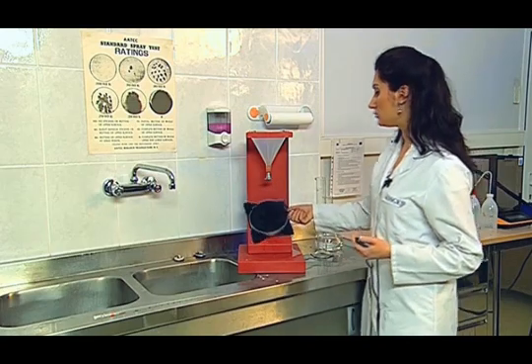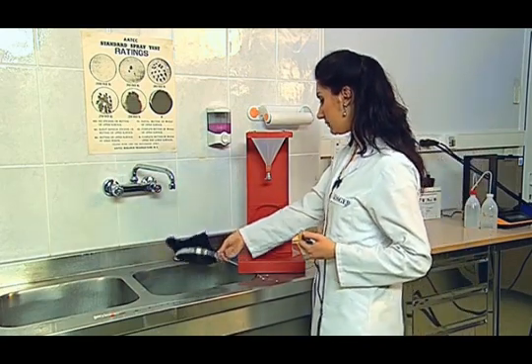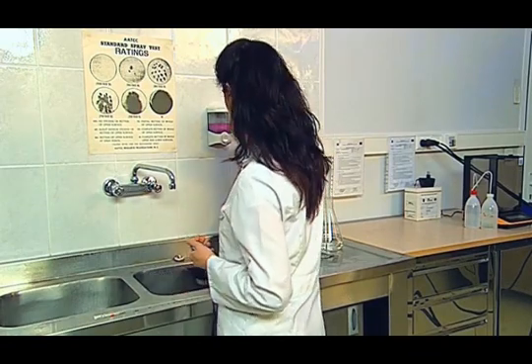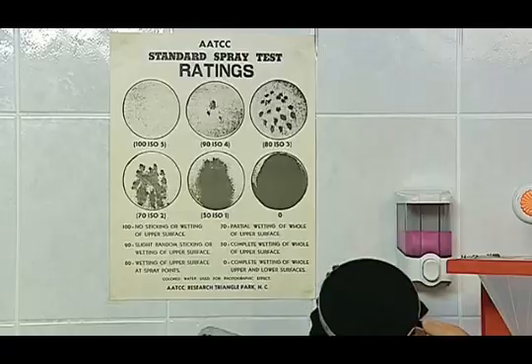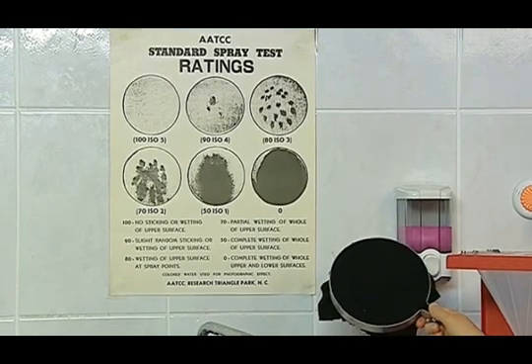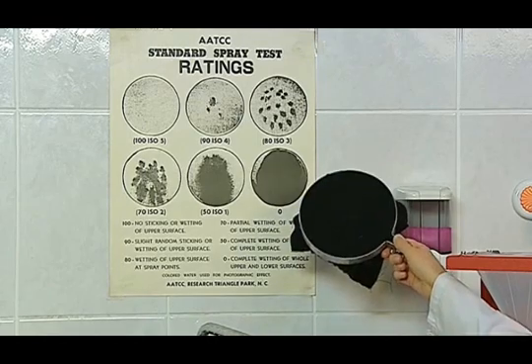At the end of this process, the sample is taken and is sharply hit by a hard object that is parallel to the floor two times. Then the degree of wetting formed on the test sample is evaluated visually with a photographic scale.